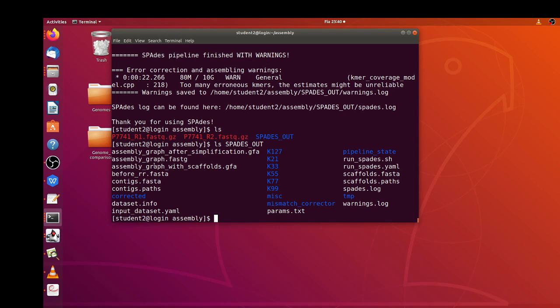Yes, so this is the contigs. In the contigs you have several short sequences with short lengths in this particular contigs fasta file. So let's see how many of them are there. I'll use this to check how many contigs are present.